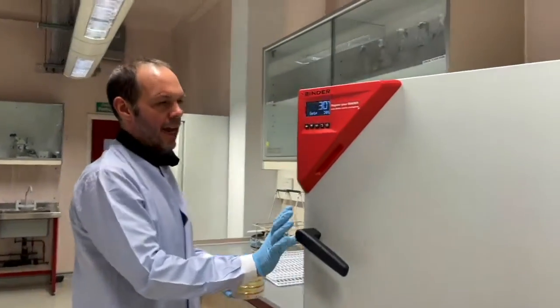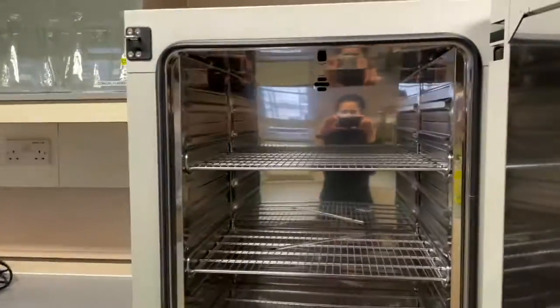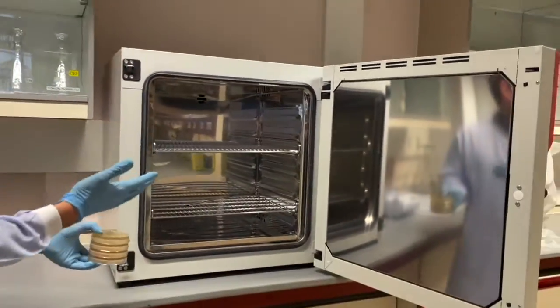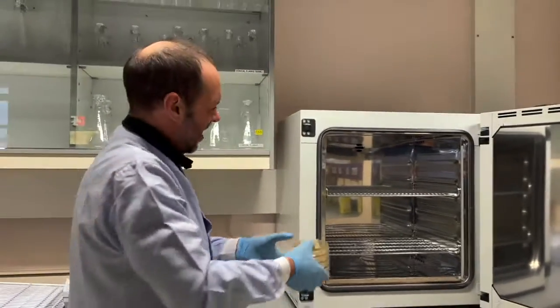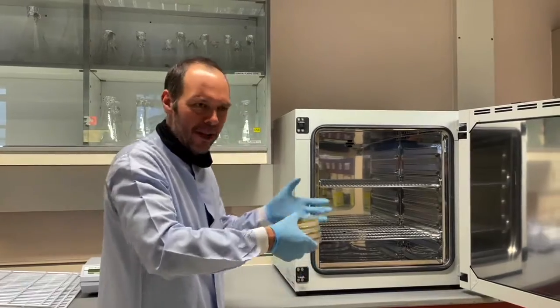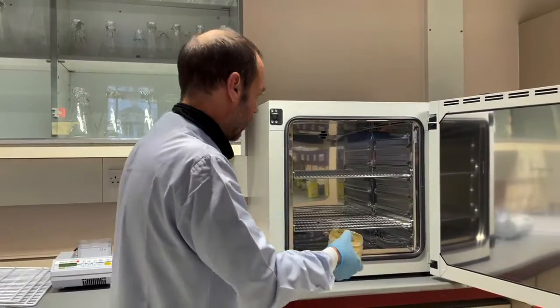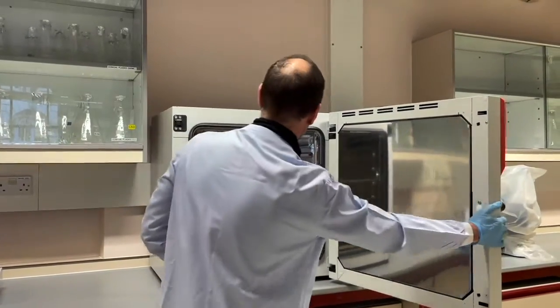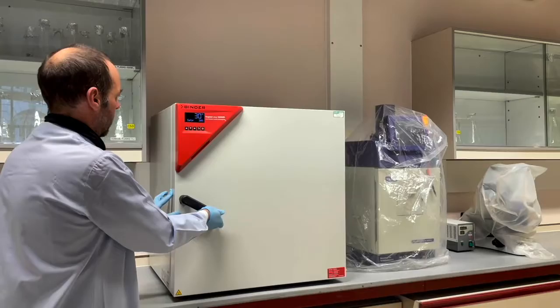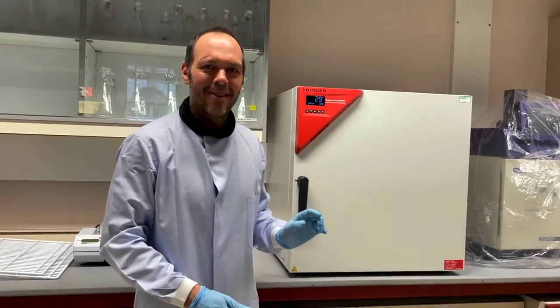If you have a big stack of plates, especially in a crowded incubator with lots of people's shared plates, it would be a good idea to wrap these in tape, because when people are shifting them around, they can knock them over. If they're wrapped in tape, it keeps them safe and makes them easier to identify. But you don't have that problem, so. All right, that'll do for this one.